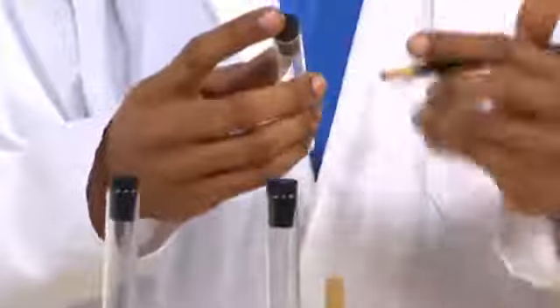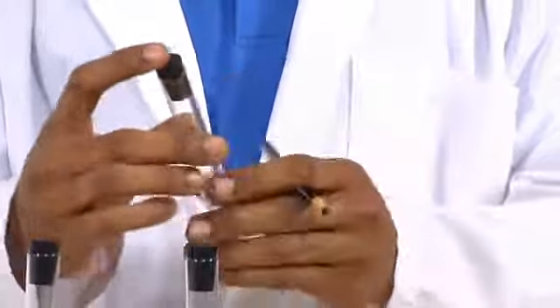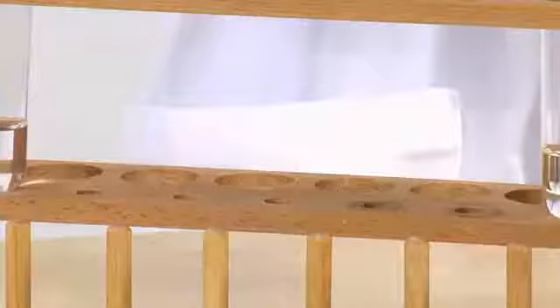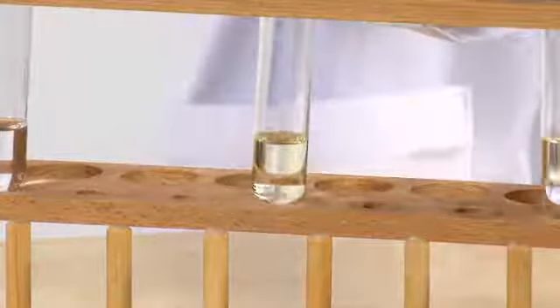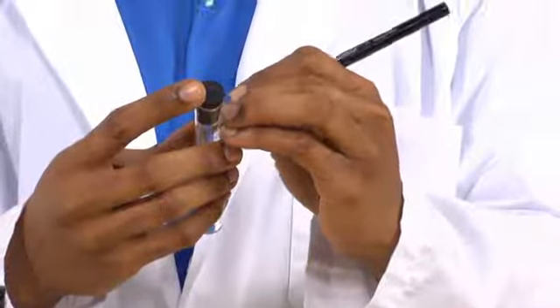Now that we've got everything, let's get started. First, I'm going to use the wax pencil to label the 3 test tubes from 1 to 3. As you can see, I've already added 2 milliliters of water to test tube 1, 2 milliliters of vegetable oil to test tube 2, and 1 milliliter of water and 1 milliliter of vegetable oil to test tube 3.